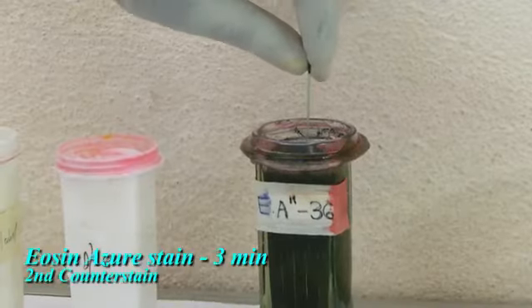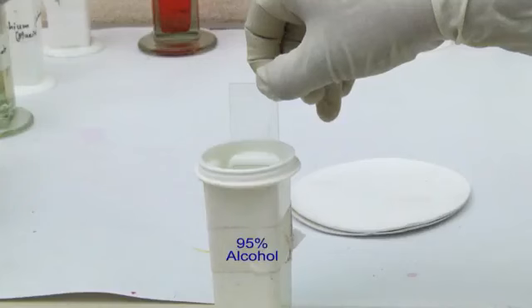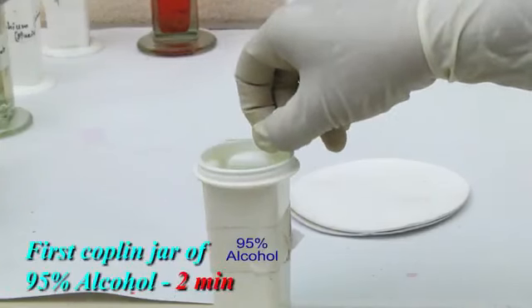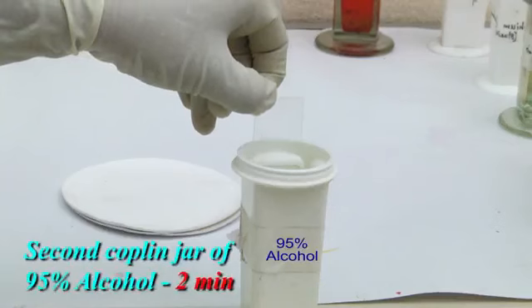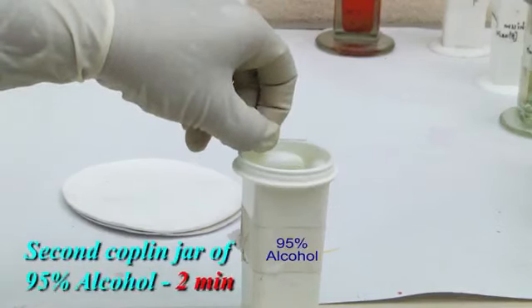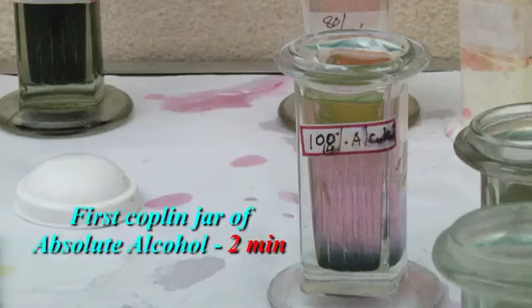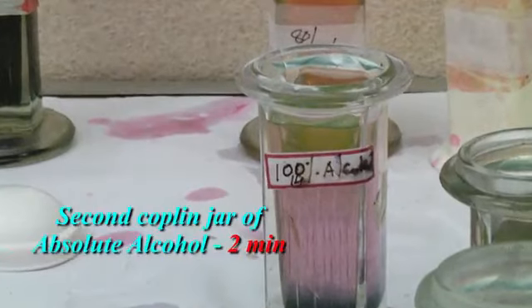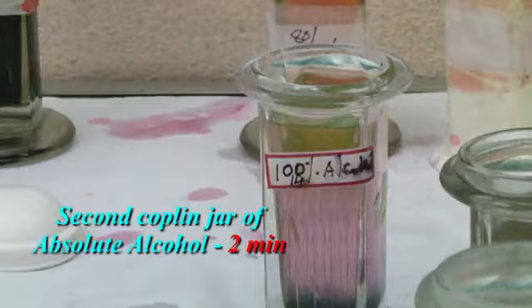Eosin Azure stain, 3 minutes. Dip in the first Coplin jar of 95% alcohol for 2 minutes. And again dip in the second Coplin jar of 95% alcohol for 2 minutes. Dip in the first Coplin jar of absolute alcohol for 2 minutes and again dip in the second Coplin jar of absolute alcohol for 2 minutes.